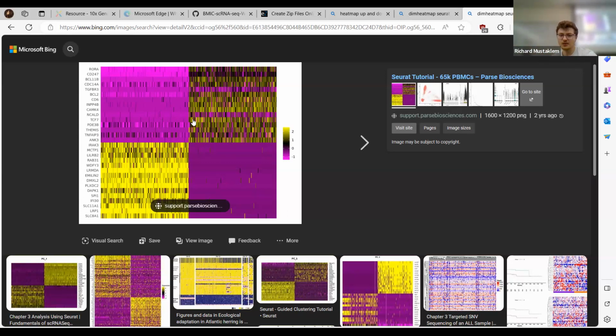But these top 10 genes, these are the most variable genes. And I need to go and look one more time to clarify, but essentially one of these will be upregulation and one will be downregulation. And you want to see, okay, these were all upregulated, and maybe there's some weird separation thing going on here, like they weren't all downregulated. Whereas down here, we have these not so variable genes. These were very downregulated. I don't know exactly what's going on here, but that's the way to read this.